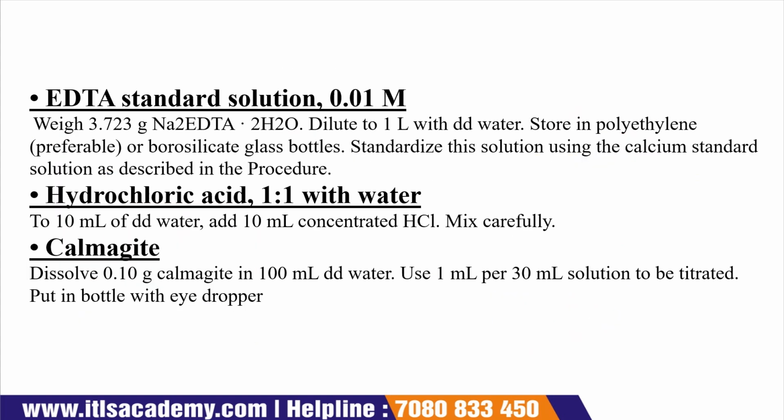Now the next one is we require an EDTA solution whose concentration is 0.01 molar. For this we require 3.723 gram of EDTA sodium salt, which will be dissolved into 1 liter of deionized distilled water, and it should be stored in a borosilicate glass bottle. This is a standardized solution using the calcium standard solution as prescribed in the procedure.